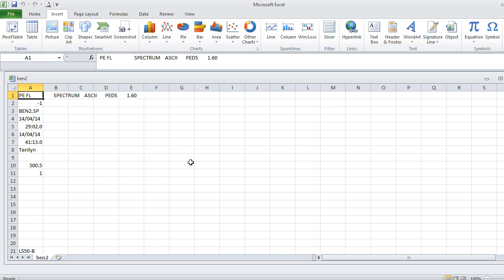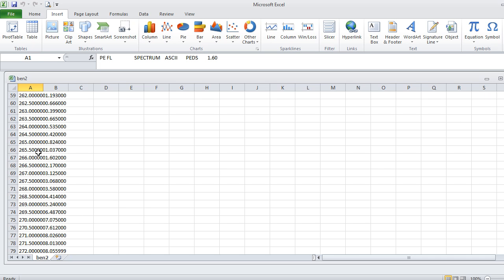This is some data taken from a fluorimeter here in the chemistry department. This data was saved as a .txt file. When I opened it in Excel, all of the data was in one column. This makes it difficult to plot and do other operations. There are two methods that allow me to separate the data.